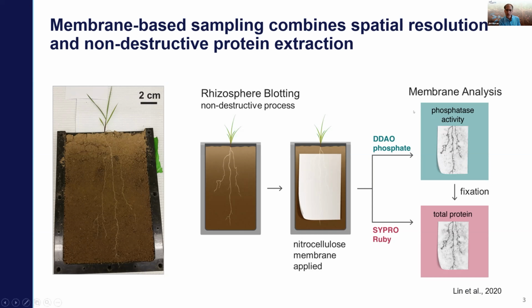I'm going to show you a couple of examples today. The first is the top, greenish component of the figure. We can perform some level of enzyme assays on that membrane. What we're counting on is that enzymes were attached to the membrane, and when we peeled it off, they retained their activity, so we can leverage that activity to locate where the enzymes are and map that. The second is that we can also stain what's on that membrane and identify what the protein distribution looks like.